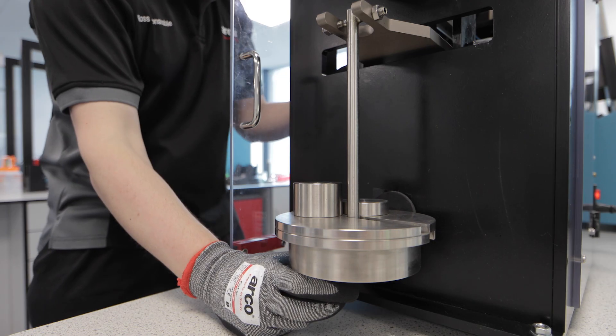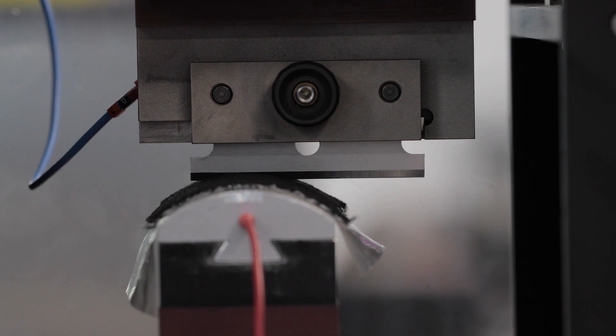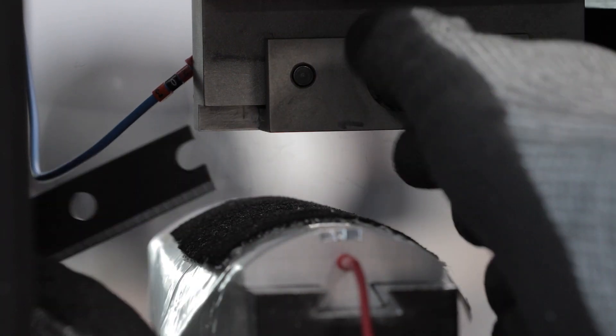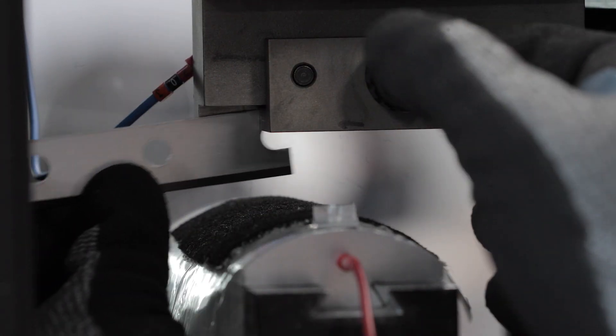The test is run at least a further 19 times with different loads each time, cutting a new section of glove. Unlike the coupe cut test, the ISO 13997 test does not suffer from blunting, as each blade only passes once over the surface of the sample and is then replaced.